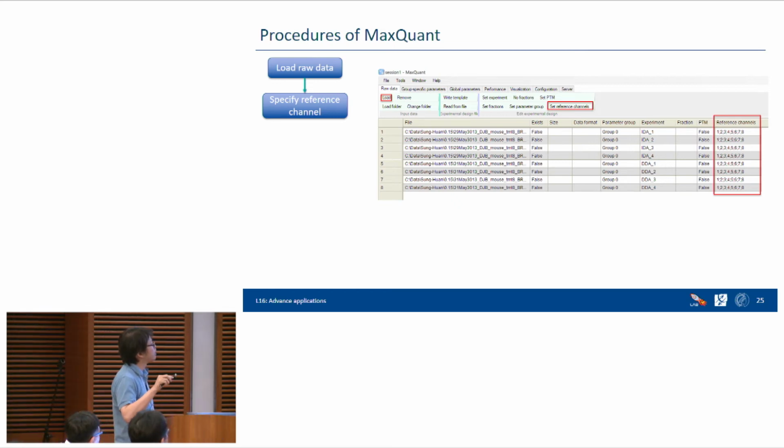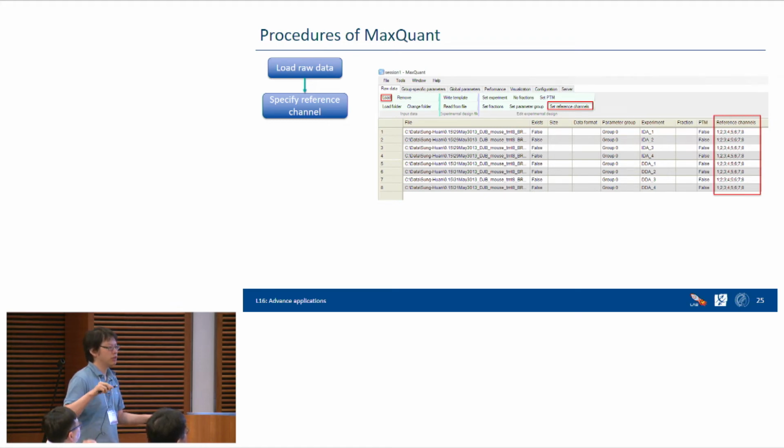So I removed these two samples, and you can see without normalization it is still grouped by experiment, but with normalization we can see them grouped by the samples. Although there's still one point here, it's okay. And if we remove 10 days, it's much clearer; only samples are grouped.